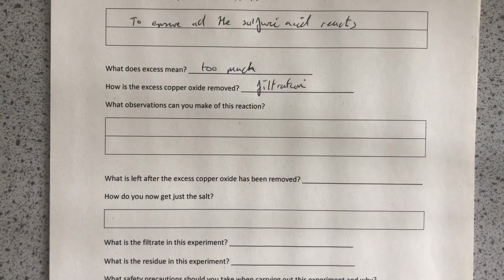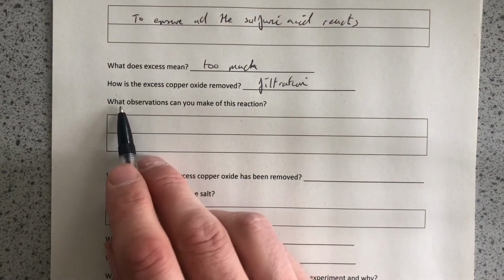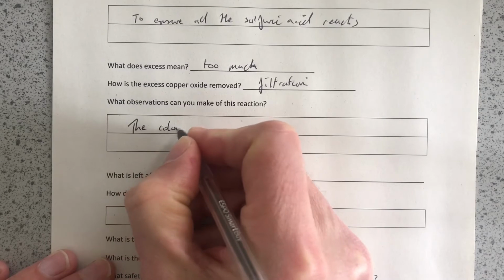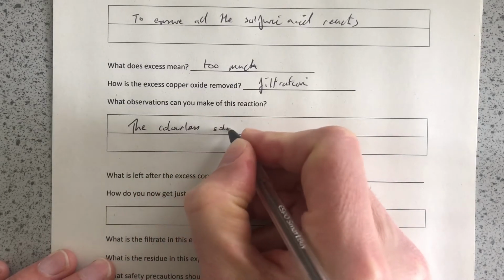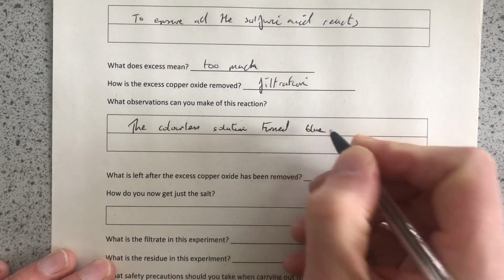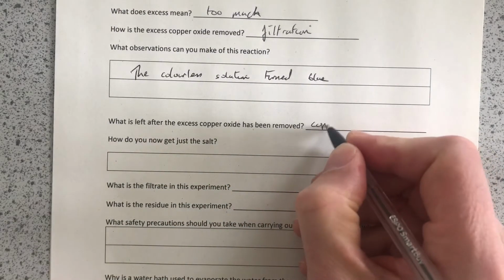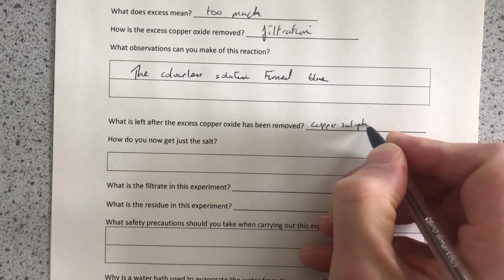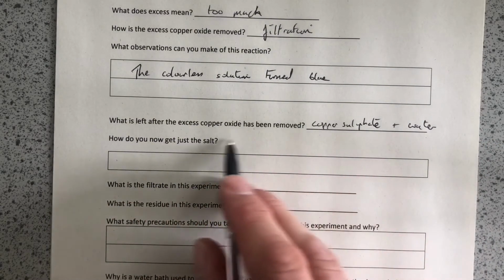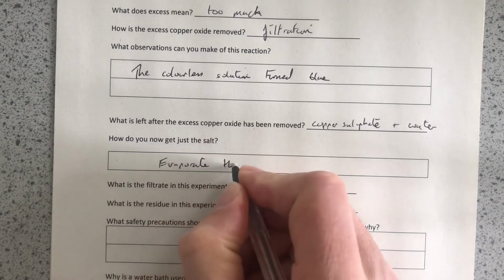While that's evaporating away, I thought we'd just finish off the questions from the workbook about this core practical. So we got as far as this. What observations can we make of the reaction? The colourless solution, because the sulfuric acid started colourless, turned blue because the copper sulfate solution is blue. What is left after the copper oxide has been removed? Answer, copper sulfate was present, and water was present too. How do we get just the salt? The salt is the copper sulfate, so we evaporate the water, and that's what's presently happening.